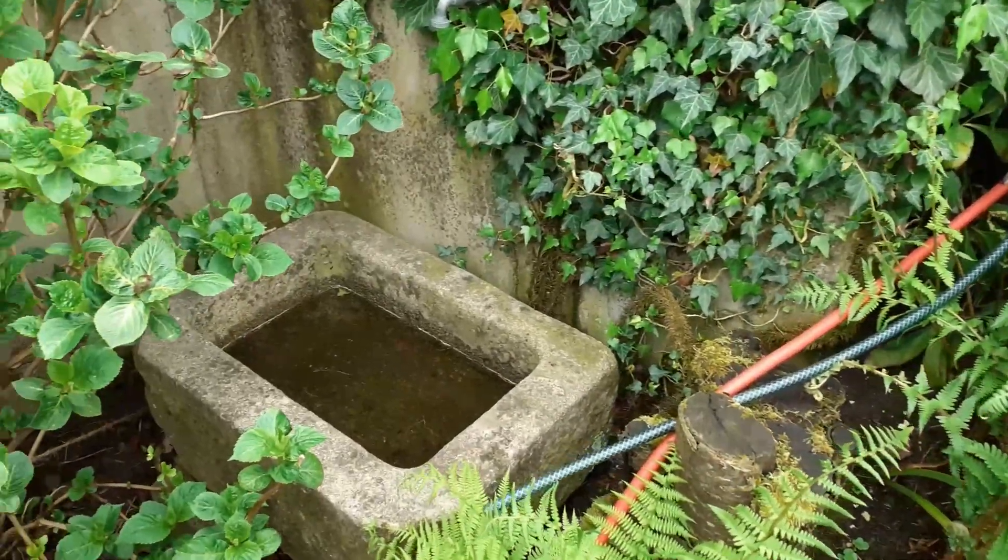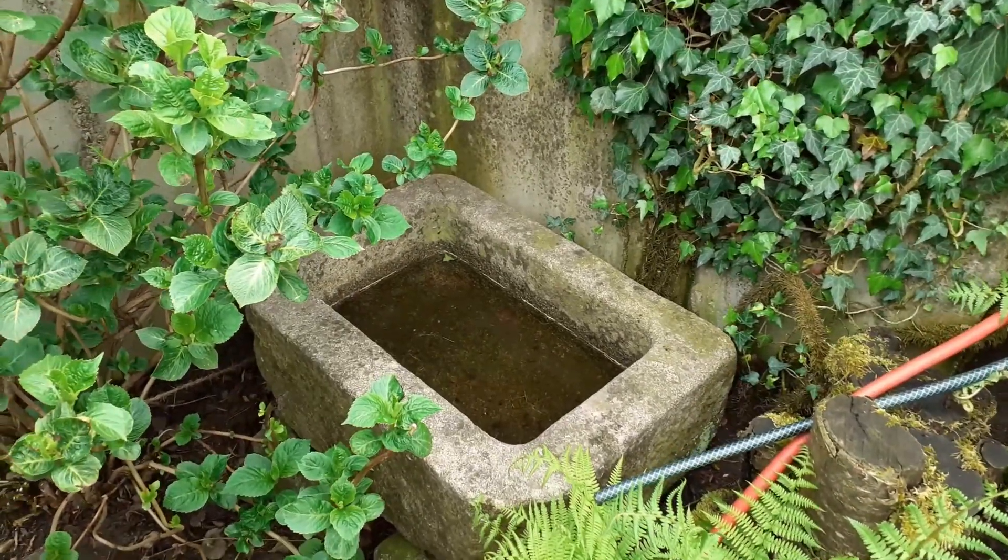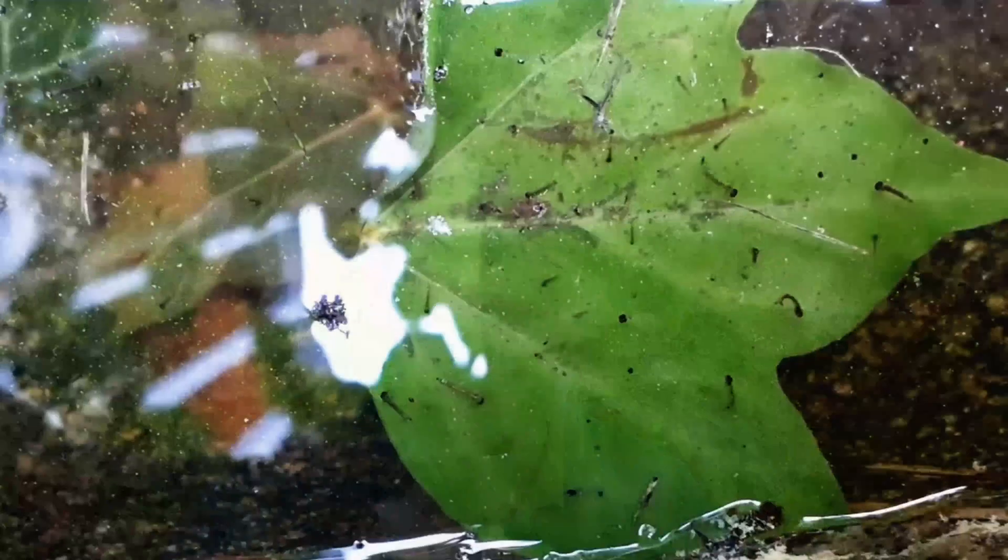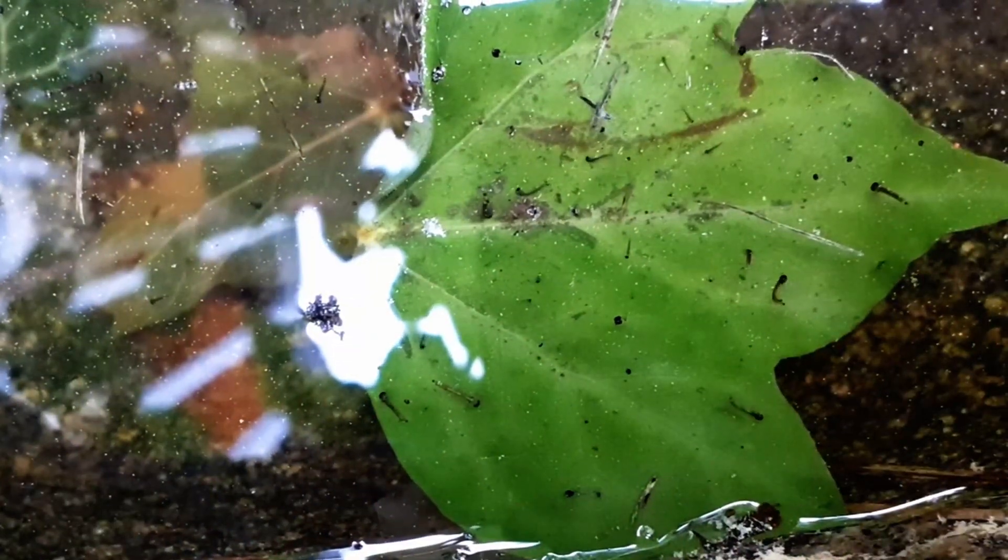I found a bird bath here in the garden and there are some interesting little things swimming in the water, quite visible with the unaided eye. I'm quite sure that these are larvae, possibly of mosquito, and I'd like to catch a few of them and put them under the microscope.